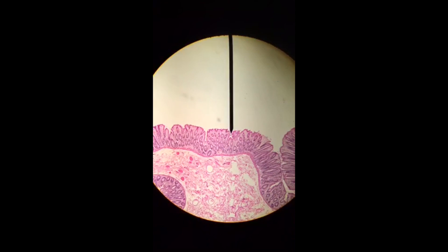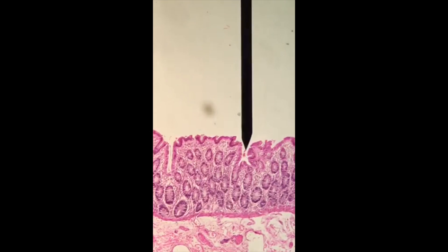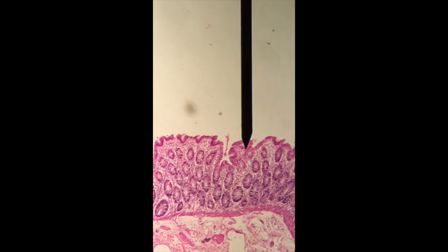Below that is going to be our final serosa. We're going to go back up top and take a look at the epithelium so we can really see the difference between the stomach and the small intestine.